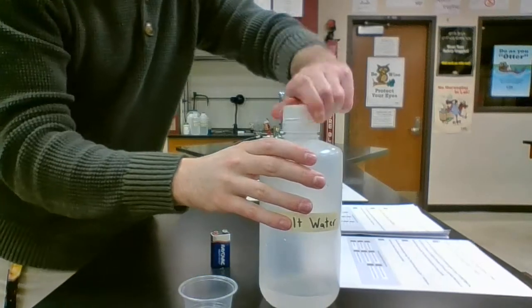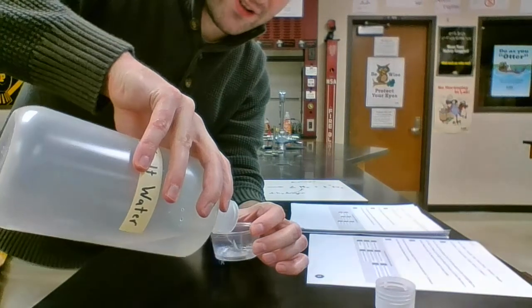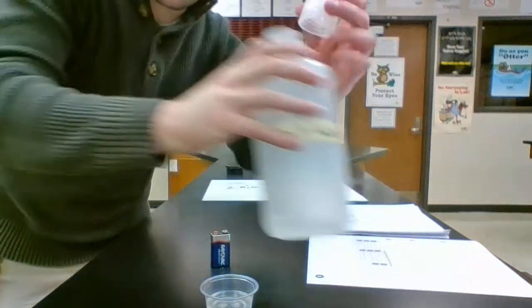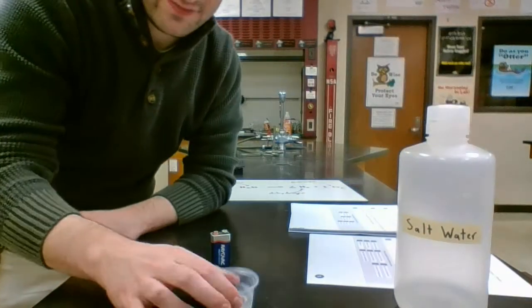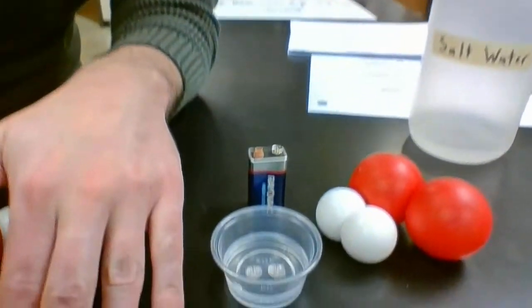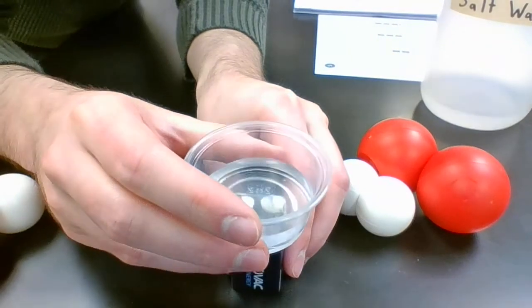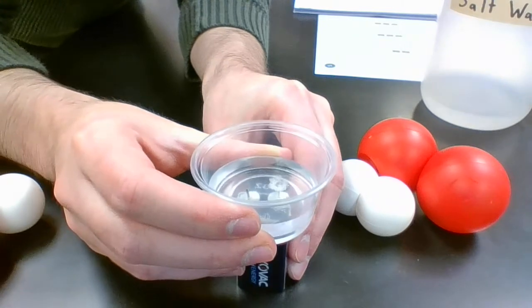So the salt in the water is just to help conduct electricity through the liquid. Water on its own isn't all that good at conducting electricity, but with salt or other minerals, dissolved ions, however you want to say it, it becomes a lot better. So there's my salt water. I'm going to get this a little bit closer here. I'm going to touch the battery to the tacks on the bottom of this cup. All right. Looks like we've got bubbles.